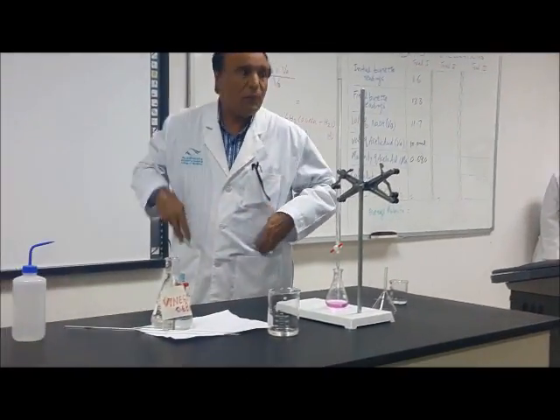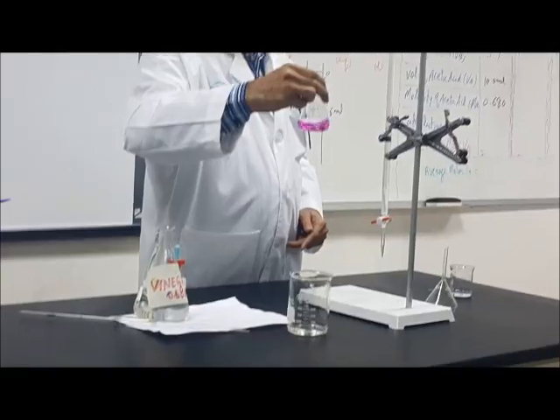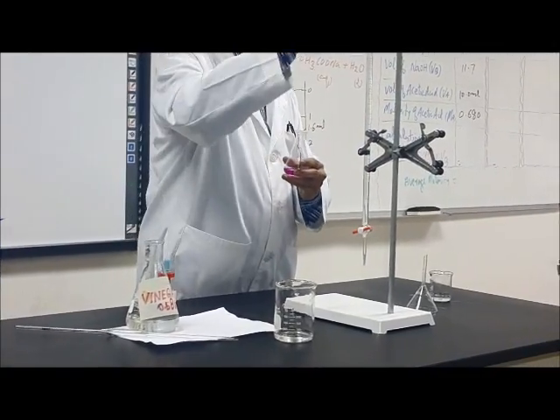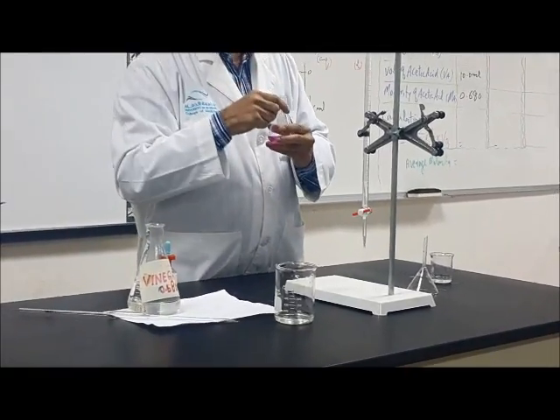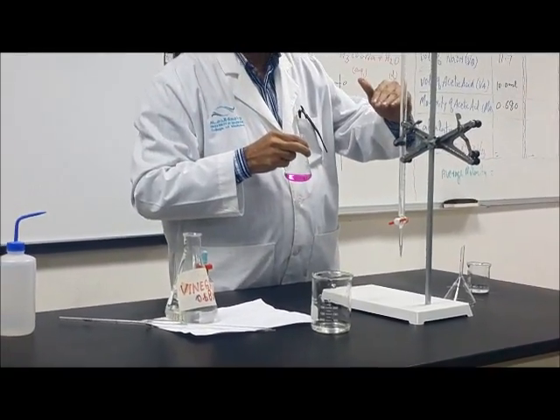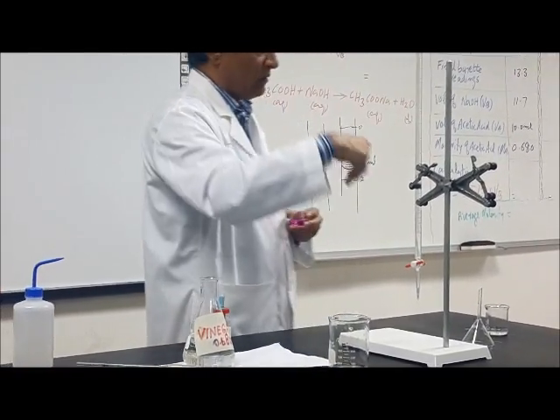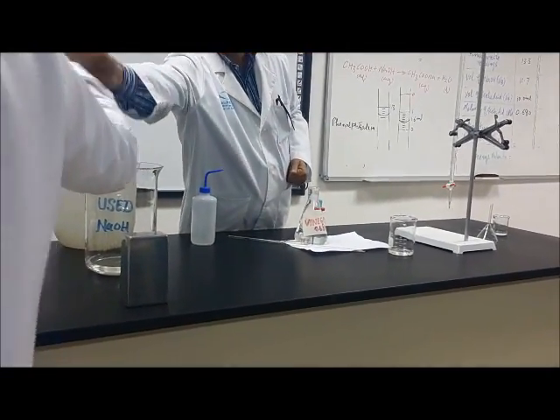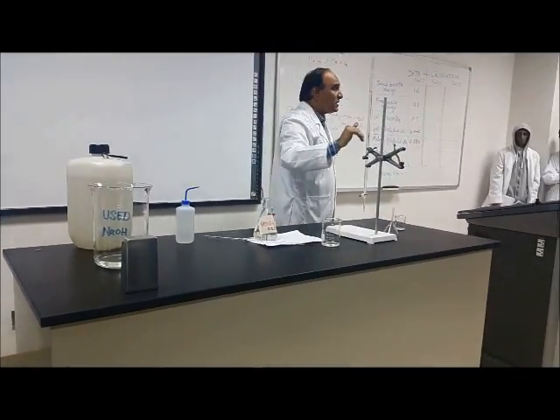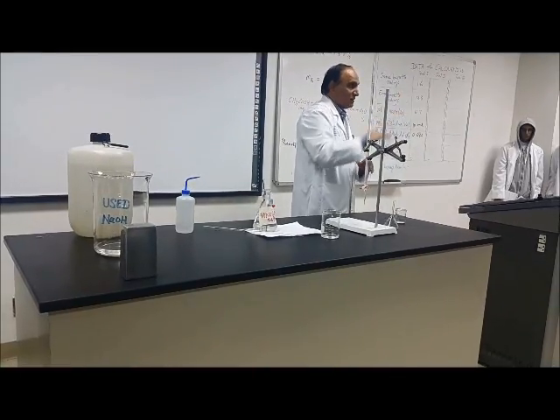Okay, boys. If you put more, for example, look, if you put more, it will remain the same, but our experiment will be wrong, because if I take that now, that is the wrong reading. It should change with 1 drop. To make sure of this, I will repeat the experiment, and there are many new things which you will learn now. When I do it the second time, can you please watch this one? Only with the tap water. In the second time when I am doing it, you will learn new things.